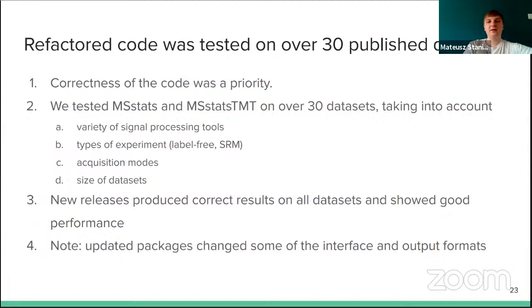So we had data sets from all the signal processing tools that we support, all the types of experiment that we support, different acquisition modes. And with all those comes the fact that we're able to test them with different sizes of data sets and different characteristics of data sets.